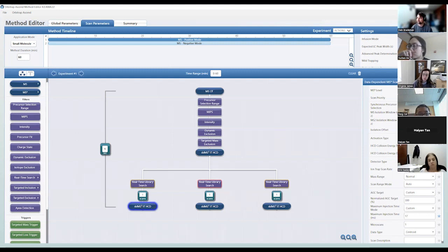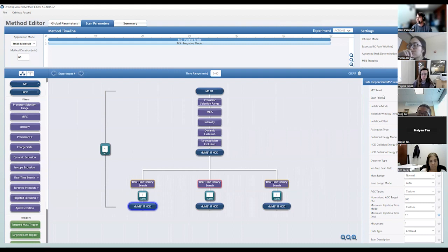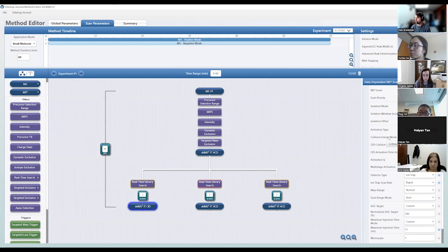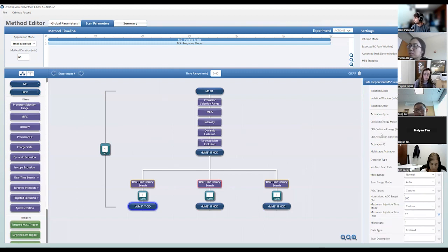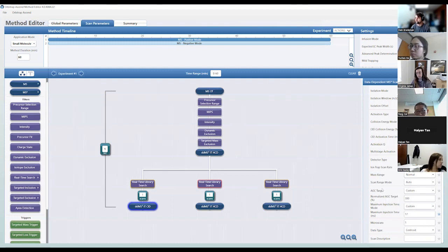Once you configure that, you set the final leg of the MSN tree. For PCs, you want to do a CID MS2 as described previously — using similar settings to the HCD MS2 but changing activation type to CID with a collision energy of 35%, which gives the best results for this MSN data. That's how we characterize PCs using the MSN tree logic and real-time library search.